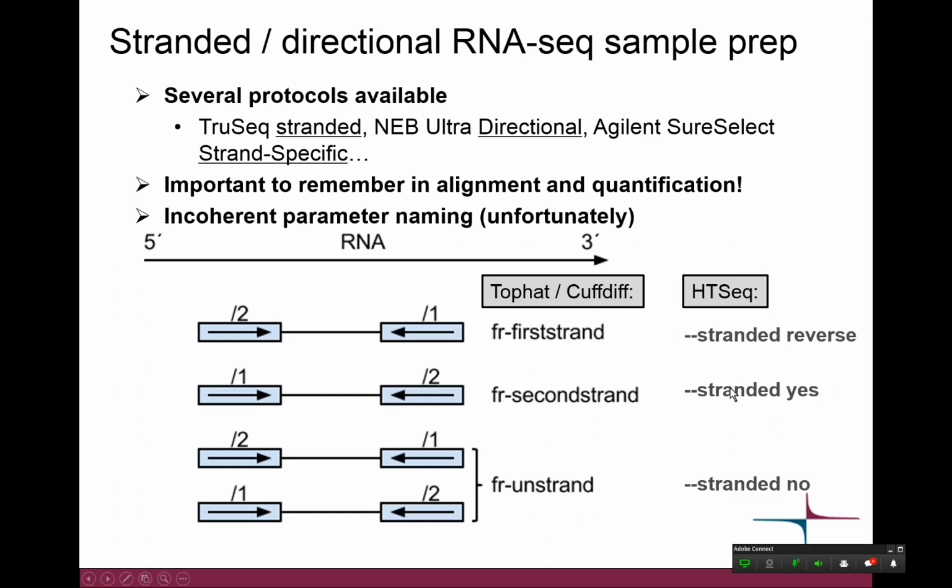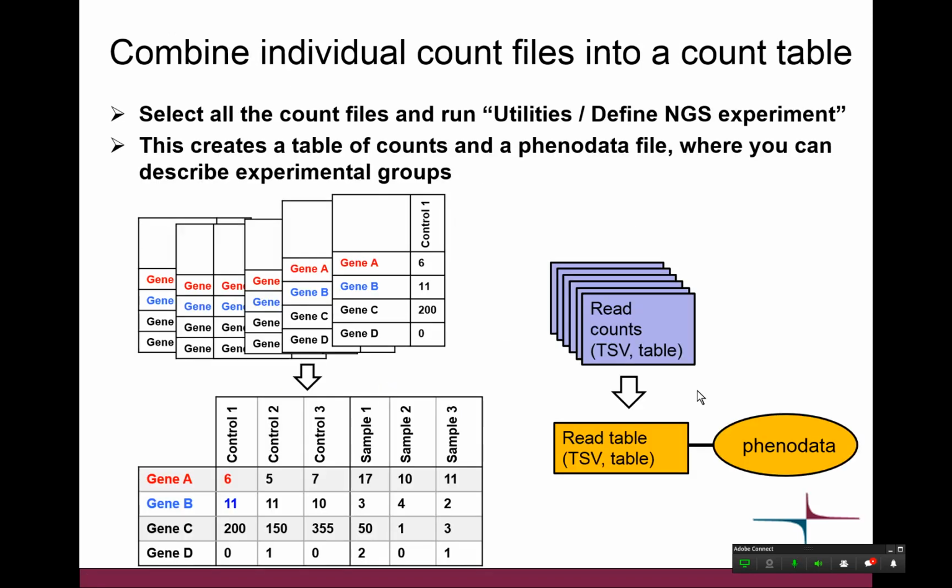We are trying to improve our manuals to make this more clear, and indeed we now have a special manual page explaining this issue in more detail, if this was a bit complex to understand at this point. Okay, then Eija will talk about combining individual count files.